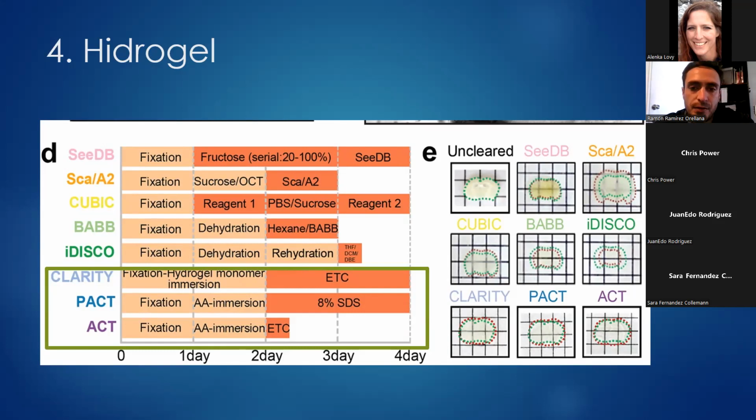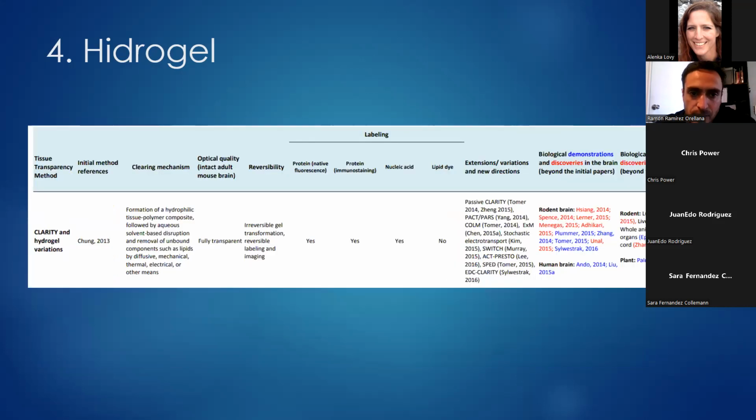Pero hemos desarrollado algunos métodos que han abaratado los costos de esto y ha funcionado bien, y los vamos a ver a continuación. Bueno, como les comentaba, está el Clarity, que ha ido derivando al clarificado activo y al pasivo, que también han ido derivando en muchas más técnicas en base a lo mismo. Incluso van mezclando estas técnicas para lograr mejores resultados.